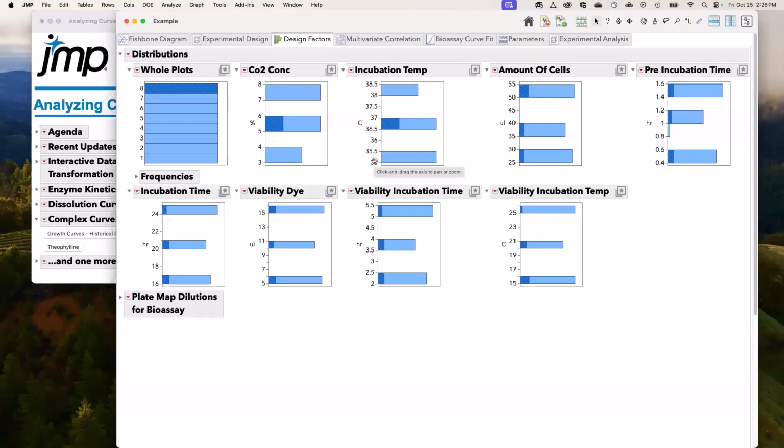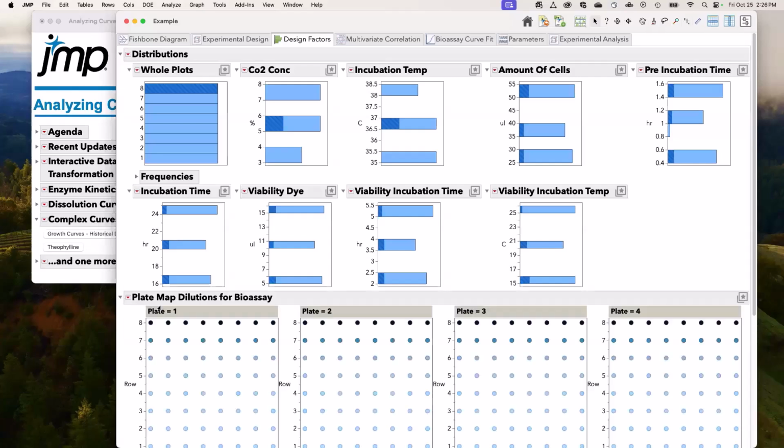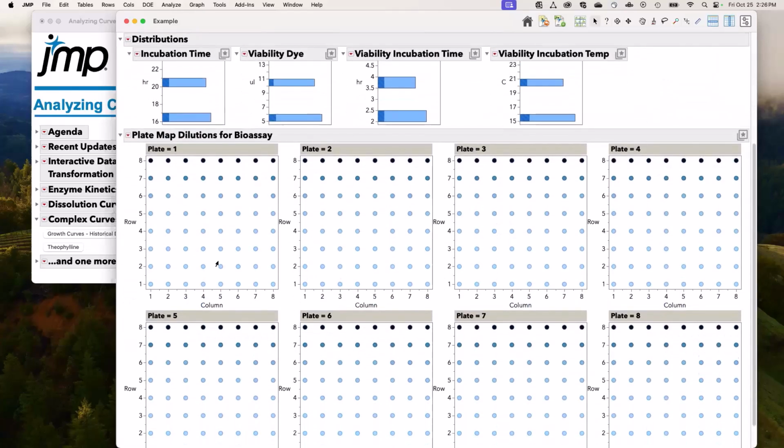Okay, and a lot of times on the biologic side, we're doing bioassays, and that means we take cells, do something to them, and watch to see how they respond. A lot of times there's a dilution associated with that. For example, if we were using a 96 well plate, we would have the same dilution of the inhibitor, or whatever it is we're looking at, across all the rows, and then each of these columns would be a different treatment option.